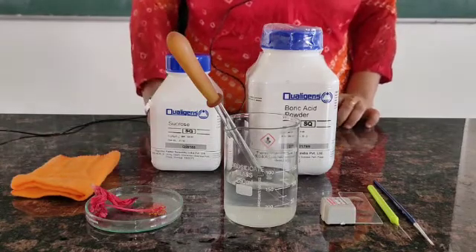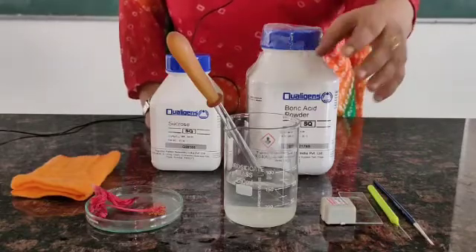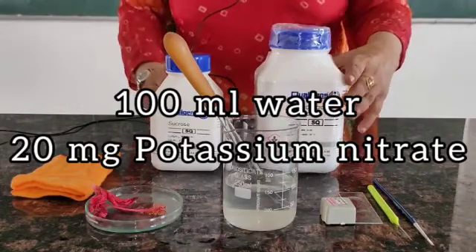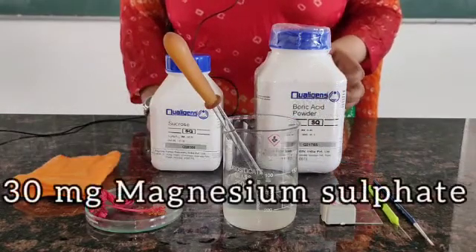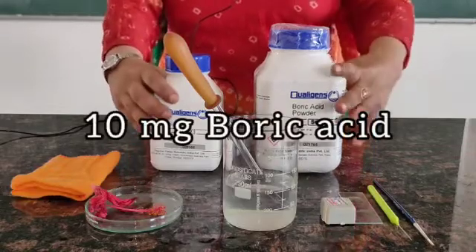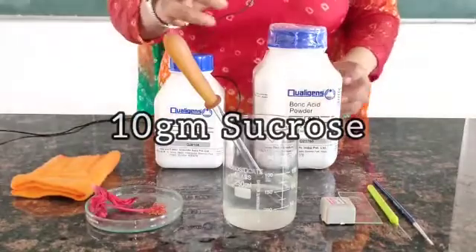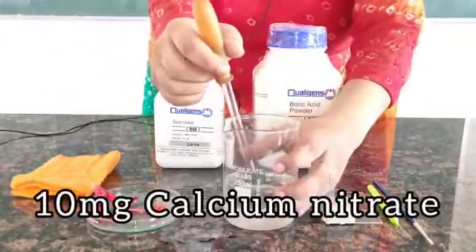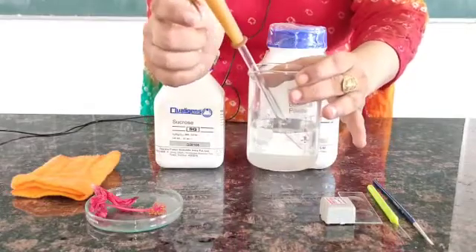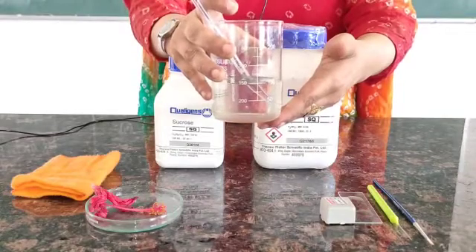Materials required. For making the nutrient medium, we take 100 ml of water and dissolve 20 mg of potassium nitrate, 30 mg of magnesium sulfate, 10 mg of boric acid, 10 gm of sucrose, and 10 mg of calcium nitrate. We dissolve all these substances together in water and our nutrient medium is ready.